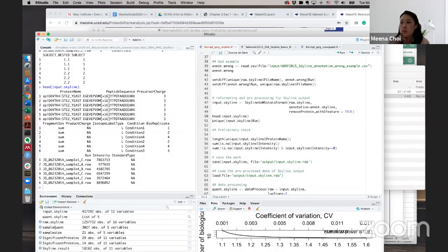There is a question about normalization. I will read it. To normalize only on the heavy reference, would MSstats do this automatically if we just designate the normalization to equalize medians, or do I need to specify it somehow? No. If we have a heavy reference, we automatically use it, because we always assume the heavy reference should be an equal amount across runs, and we think it is truly a heavy reference, not a heavy condition. So you don't need to worry about it. MSstats just uses the heavy reference for normalization.